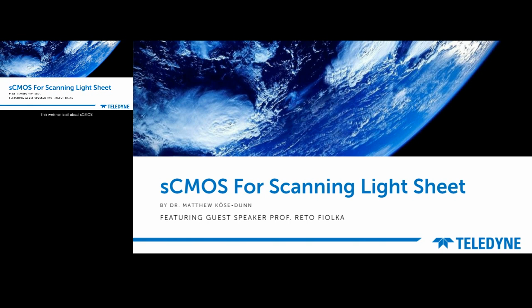This webinar is all about sCMOS cameras for scanning light sheet. If you'd like to learn more about light sheet, I have previously done a webinar concerning light sheet basics and static light sheet in June of 2022. If you'd want to hear more about this and get a general overview of the technique, then that webinar is available on demand from LabRoots or from the webinar page of the Photometrics website.